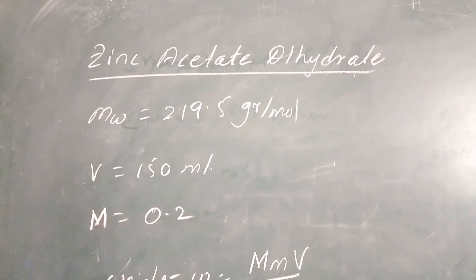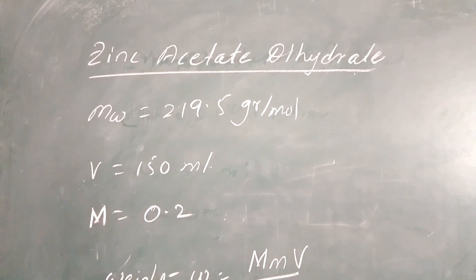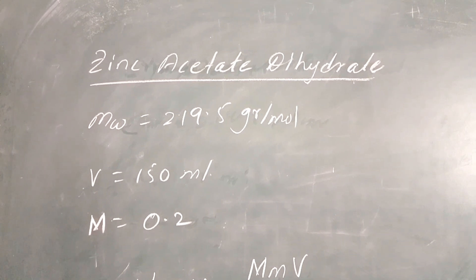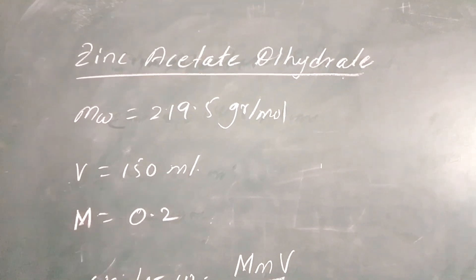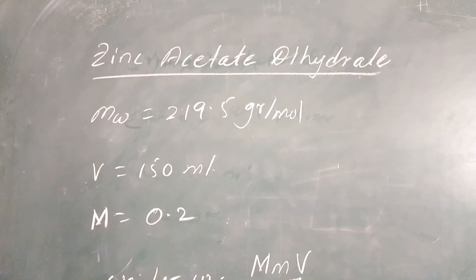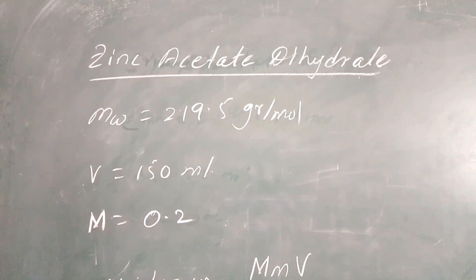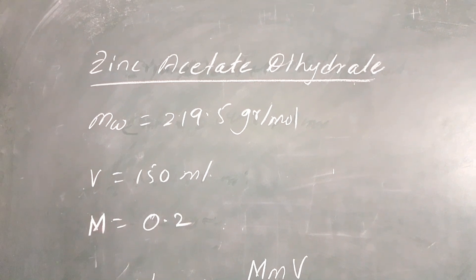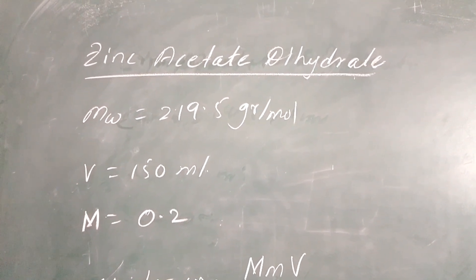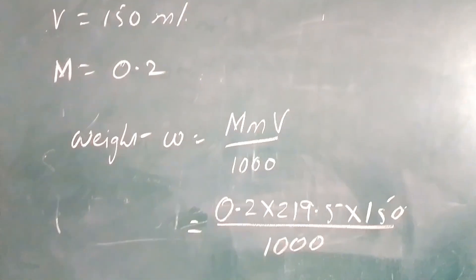I am going to take 150 ml of solvent, which is a combination of 75 ml of methanol and remaining 75 ml of 2-methoxyethanol. I am going to prepare the zinc complex solution with a concentration of 0.2 molarity.